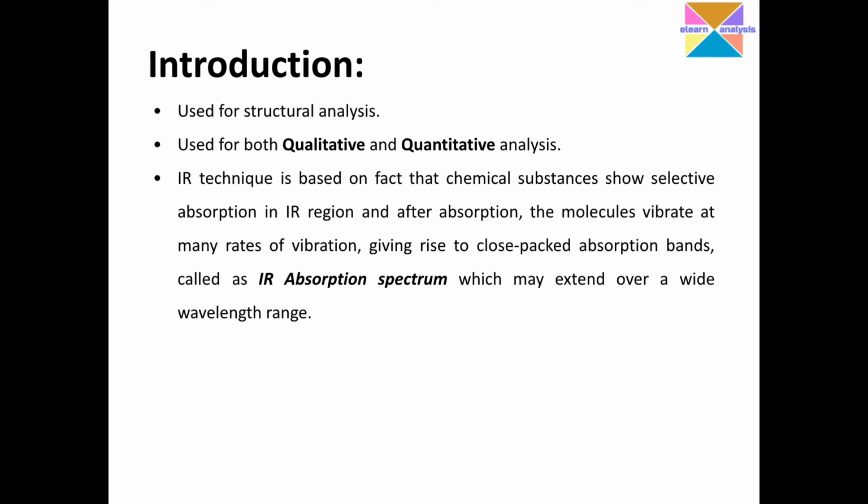Similarly, as in UV visible spectroscopy, the compounds having either double bonds or triple bonds, or which are rich in electrons, were usually sensitive to UV radiations, and these electrons were taking up high energy and getting excited to the excited state. That was the principle we studied in UV spectroscopy.